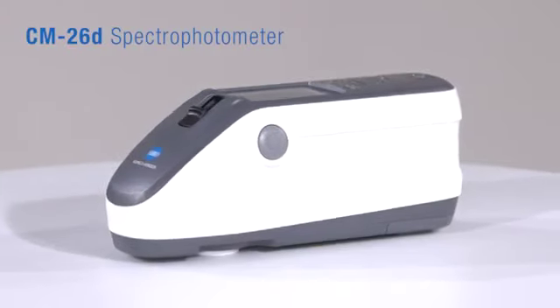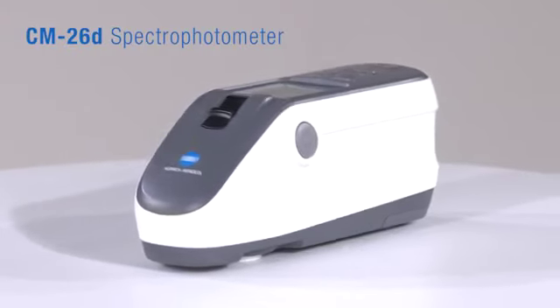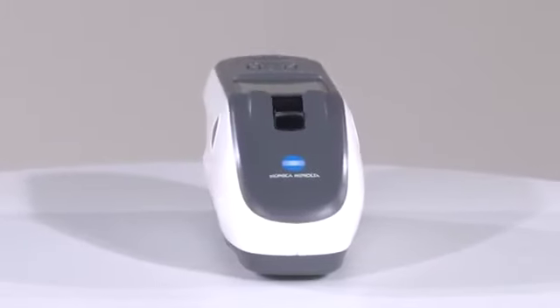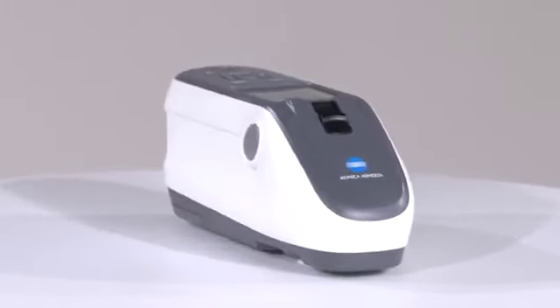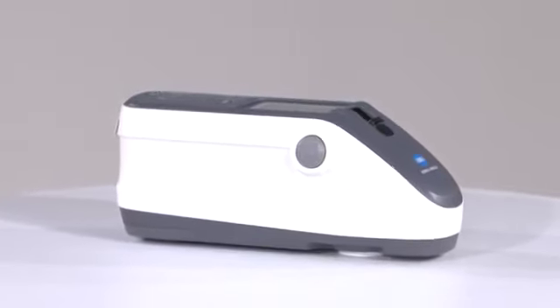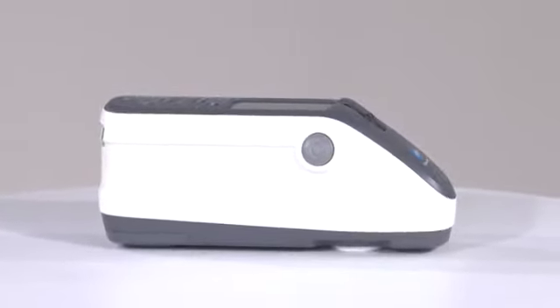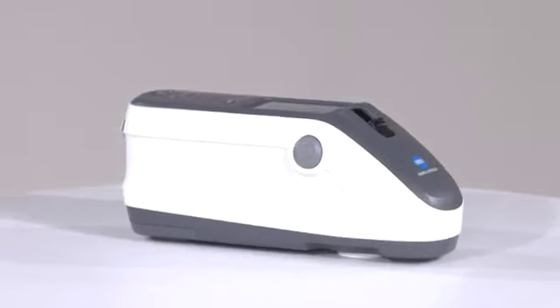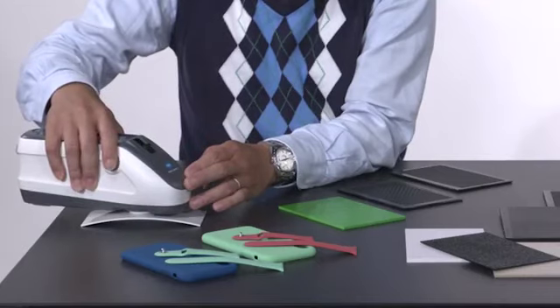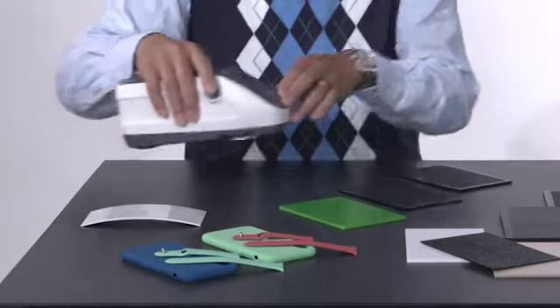Konica Minolta's all-new CM26D is the next generation of portable sphere spectrophotometer with its unprecedented accuracy and inter-instrument agreement, which was previously reserved for laboratory-grade instrumentation. With its lightweight ergonomic design, optional Bluetooth and high-resolution TFT color display, the CM26D is perfectly suited for applications in the field, production line, or the lab.